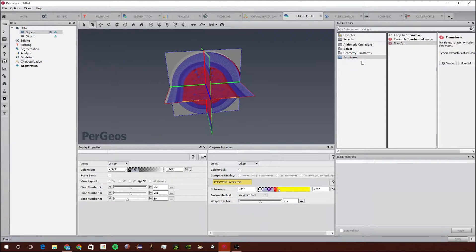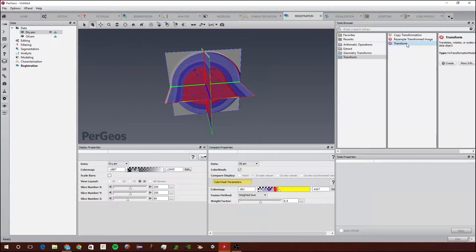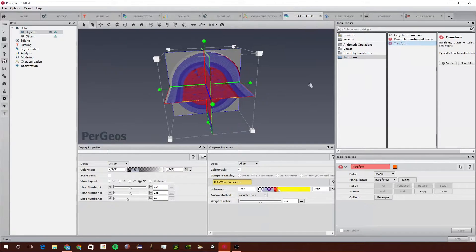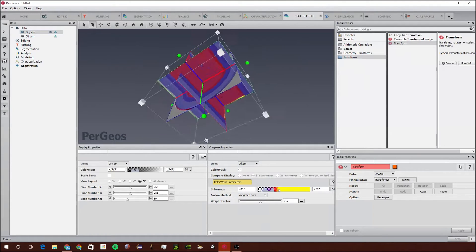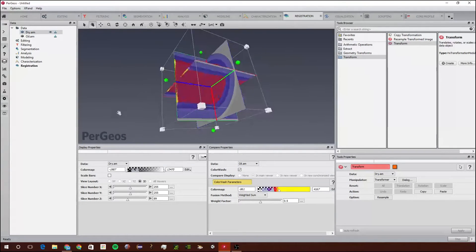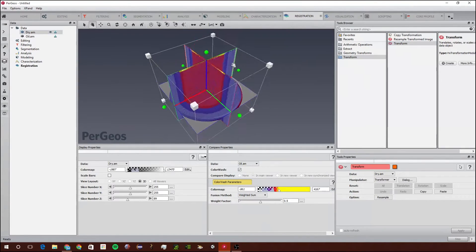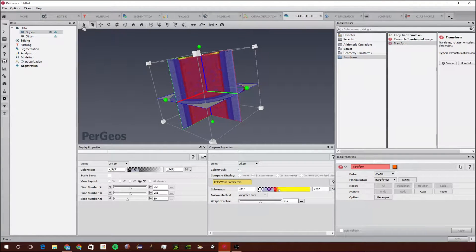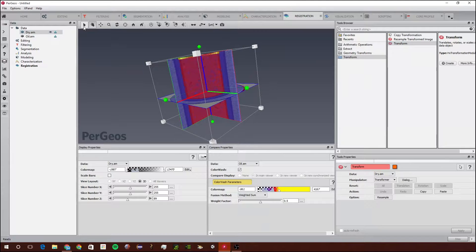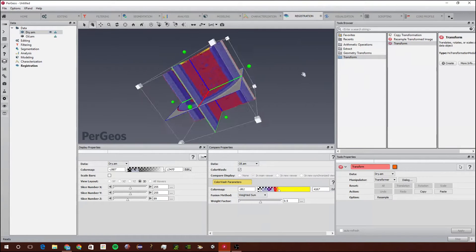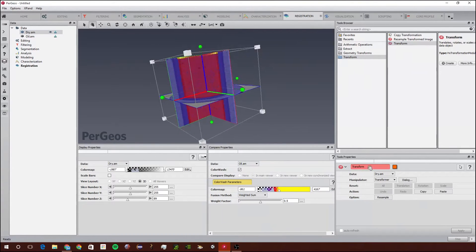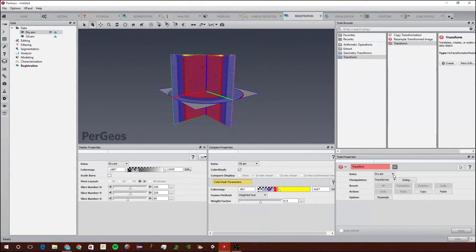To align them closer we can use the Transform tool and double click on this. As you can see, this bounding box appears and this allows you to scale and rotate the images so they're more closely aligned. But this image is close enough so we will not need to do any transformations on it.